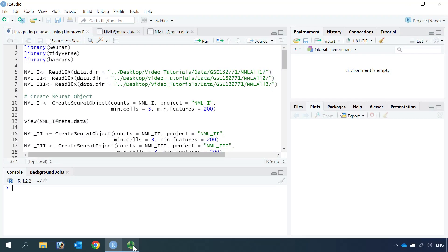Hi everyone, welcome back to my short video tutorial. Today I'm going to show you how to perform data integration using Harmony. We know our single cell RNA sequencing data have batch effects. The batch effect could result from different samples or different technologies used to prepare the dataset. So we need to correct the batch effect for better data integration.